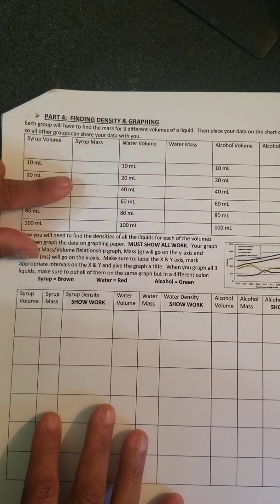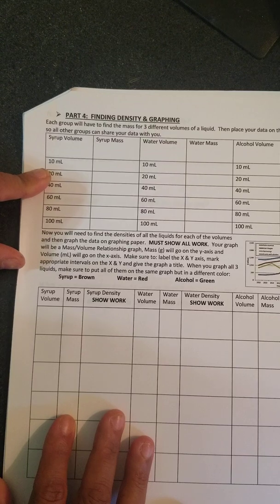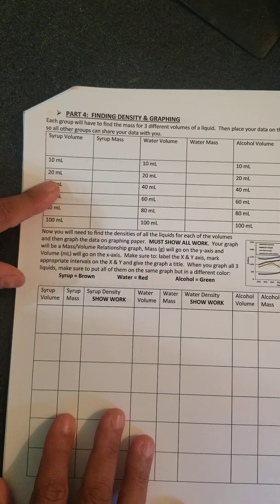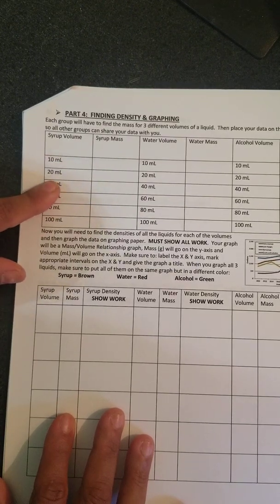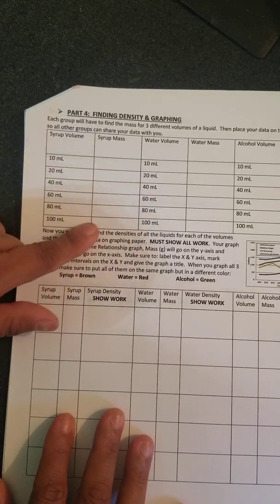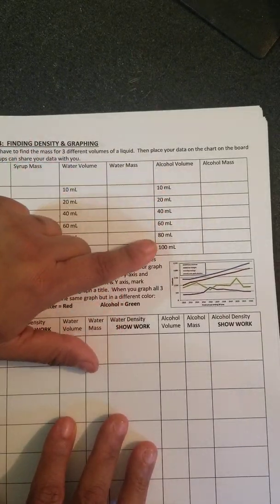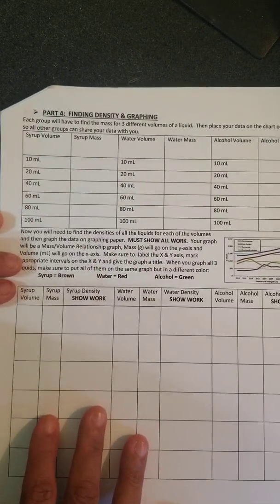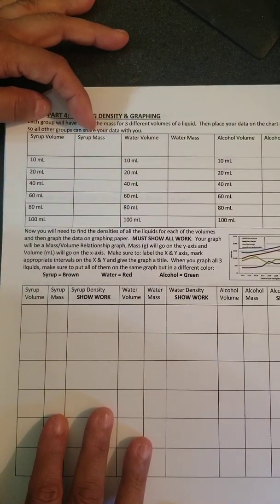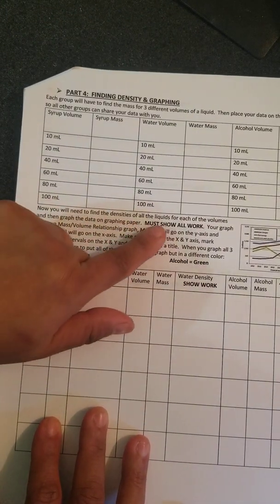I'm going to get pancake syrup, and I'm going to put 10 milliliters into a graduated cylinder. We're going to find the mass on a scale of just 10 milliliters. We're going to do it again, and I'm going to pour 10 more to make it 20, and then 40, 60, 80, 100, and you're going to see what the scale says on the mass. I'm going to do that for water, and for rubbing alcohol. After I do that, you're going to have the volume and the mass. With those two values, what could you find? The density.